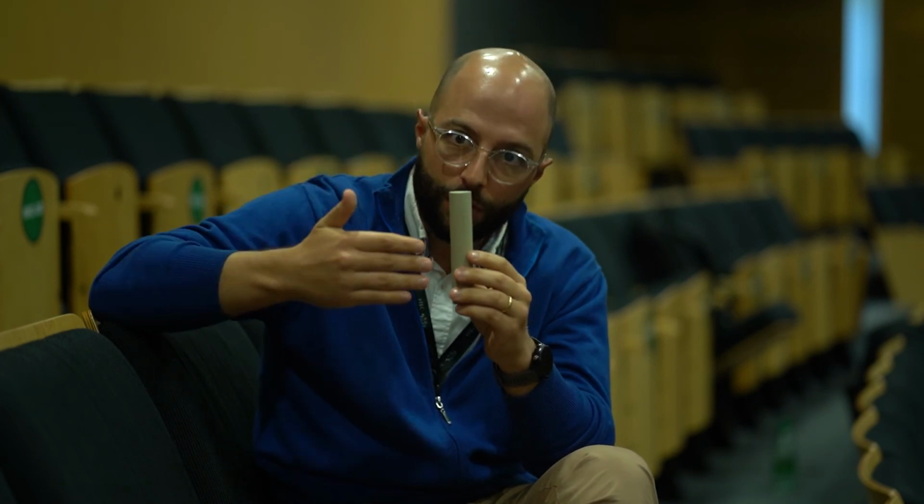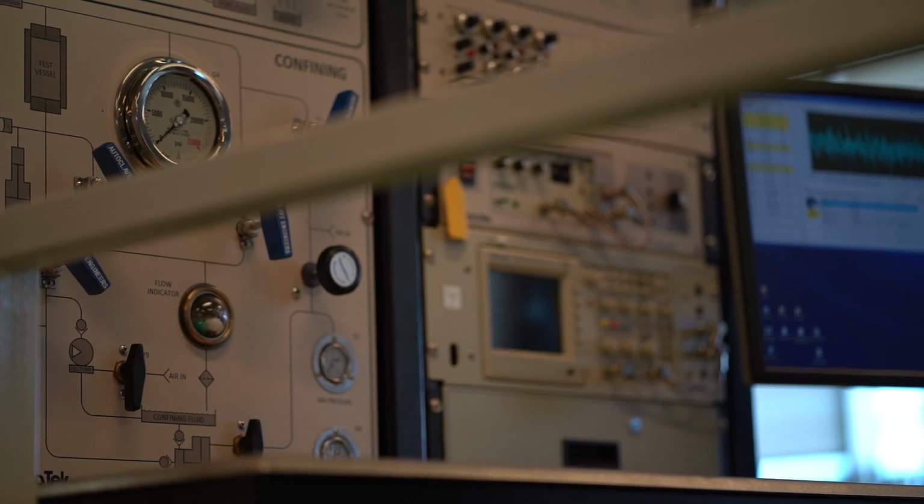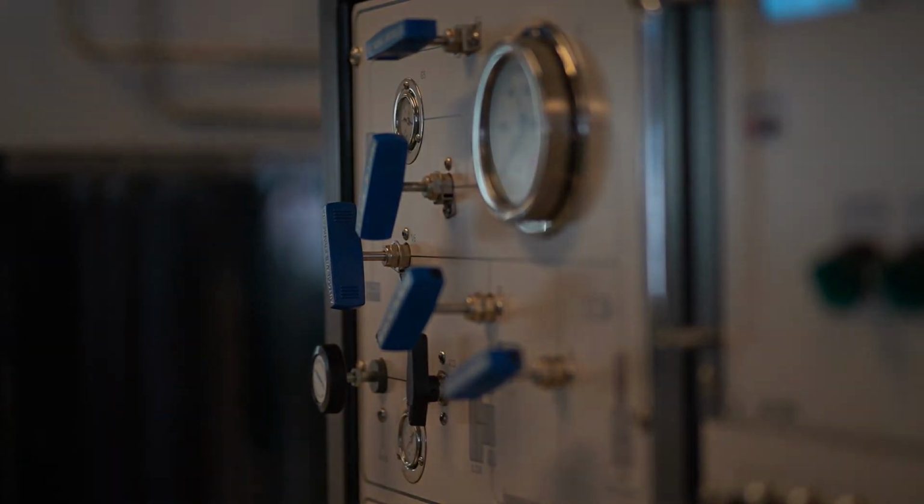So what you want to do is you want to use the information of the permeability of the rock and the hydraulic conductance of the rock, to see how much pressure you need to apply in wells to generate some kind of intake of the fluids in the formation. There you go. This is the story of how you get a rock sample, you extract information from it to use it in the field for some practical applications.